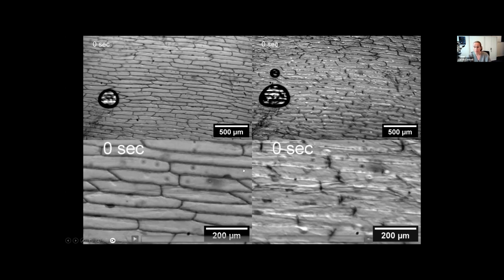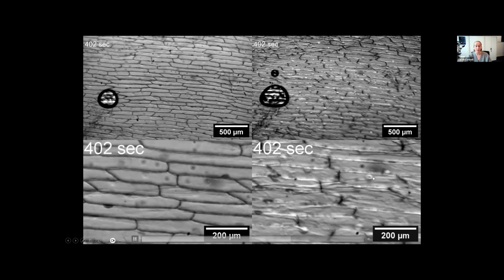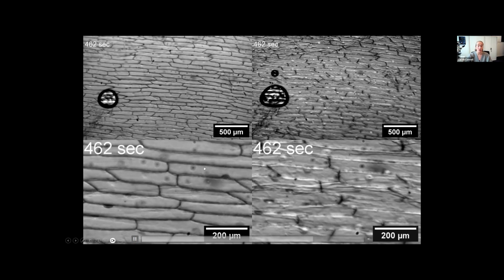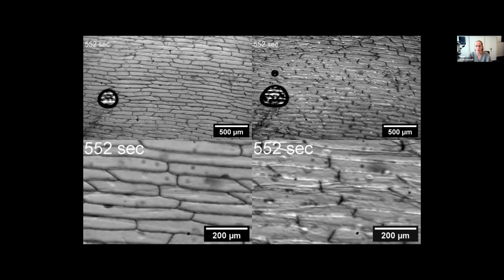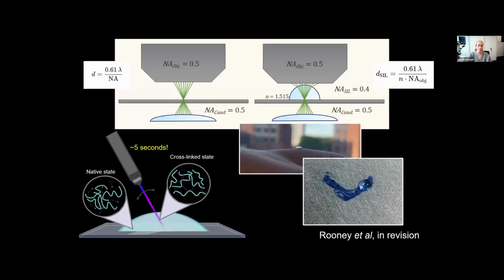But if I press play on a movie, hopefully it will. What we can see in this movie, where we do have that lens coupled biprism, is that we are able to now see and resolve cytoplasmic streaming events, which are completely invisible in an ordinary stereo microscope. So we are able to improve this robust, widely used and accessible stereo microscope technology.